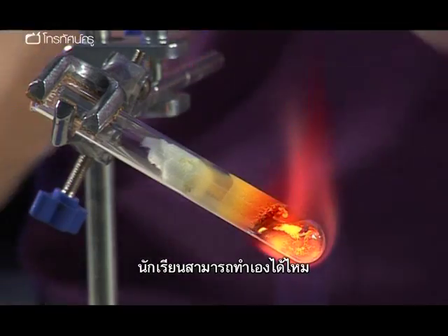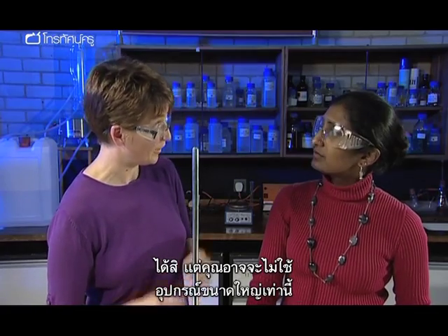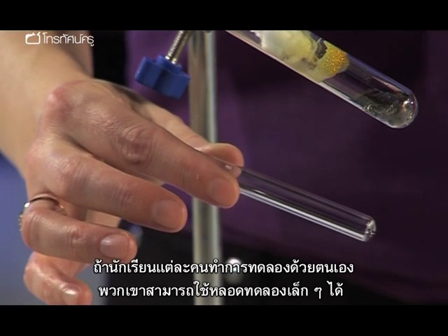Could students do this themselves? Yeah, they can. You wouldn't want to do it on quite such a large scale if the pupils were doing it individually, but you can use a little mini test tube.